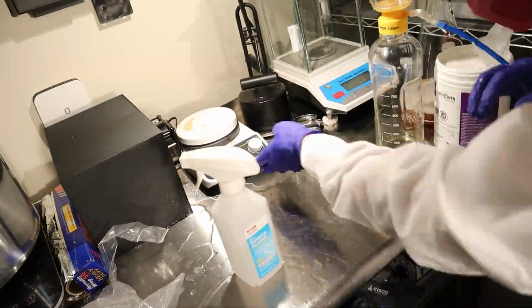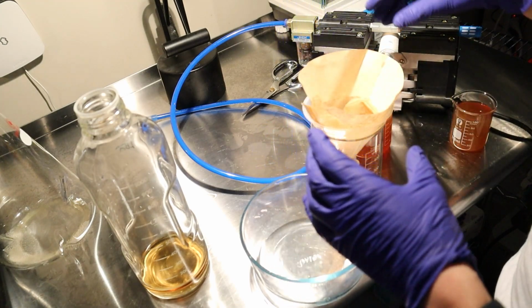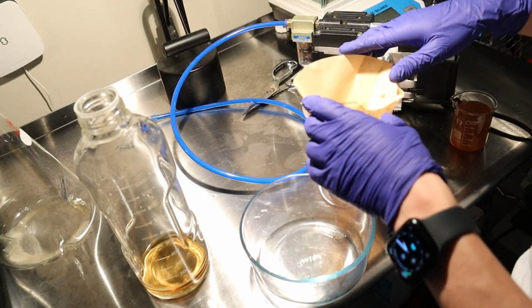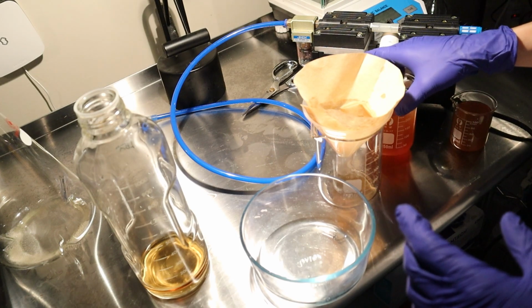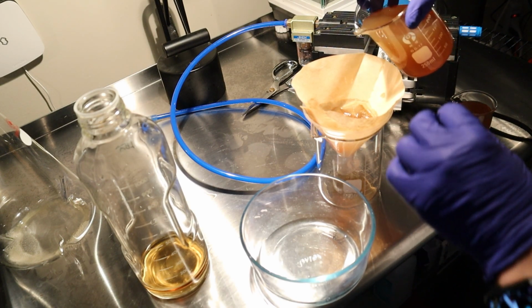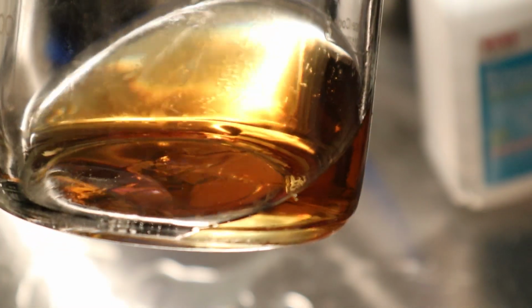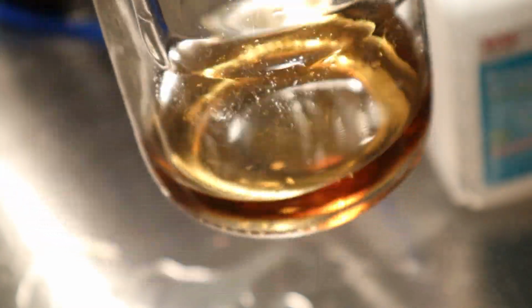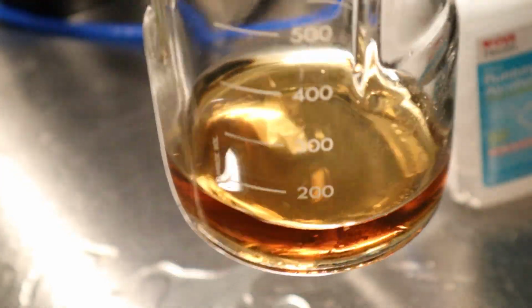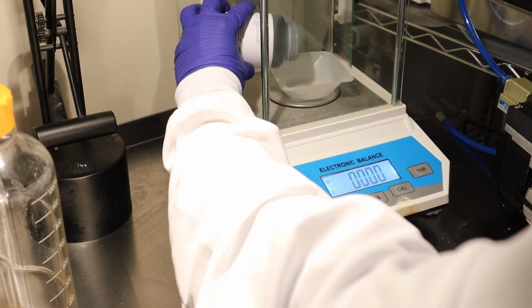Luckily, it mostly stayed on my wall and wasn't too hard to clean up. After finding out my stronger pump wouldn't fit, I ordered some coffee filters and pre-filtered the culture, and tried again, but only managed to get 100 mils after letting it run overnight and going through over 8 0.22 micron filters. All that for this. 100 milliliters. On the verge of giving up and starting over, I continued anyway and moved on to the next step.